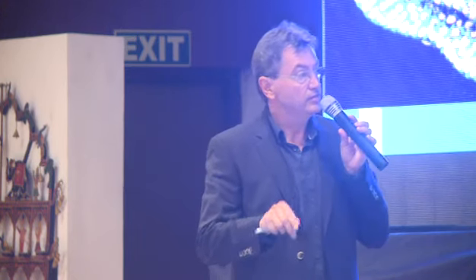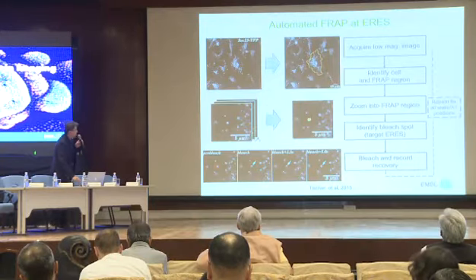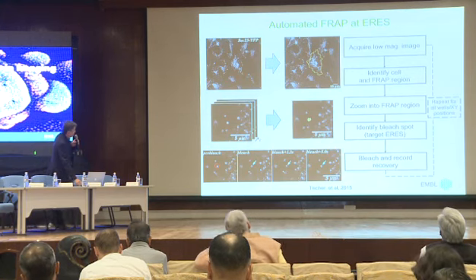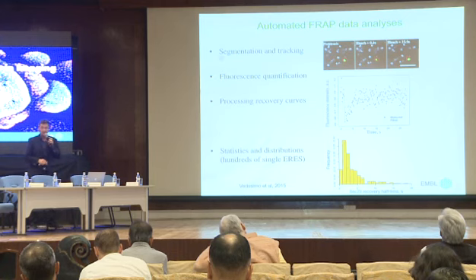This is before the bleaching, shown over here. Then we bleach it, not everything, because this is very important in such experiments, and then see how the intensity comes back. And these cycles can be repeated over and over again. In an overnight experiment, again, you can have hundreds of such ER-exit sites being monitored under different conditions.